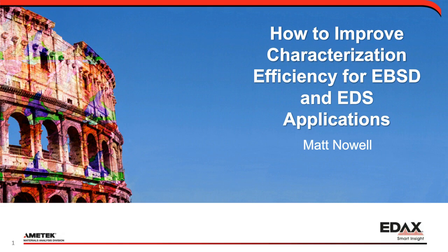Thanks, Jonathan, for that introduction, and thank you. Good morning or good afternoon to everyone for attending. We appreciate it. Today I'm going to talk about how to improve characterization efficiency using EDS and EBSD.